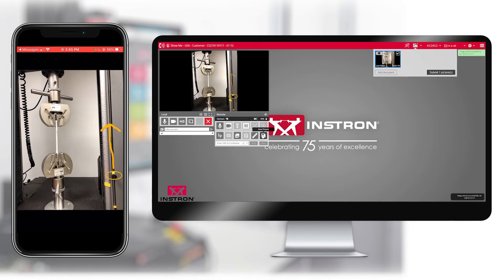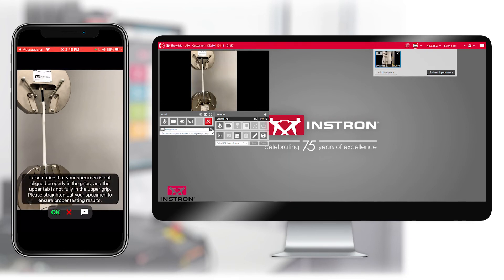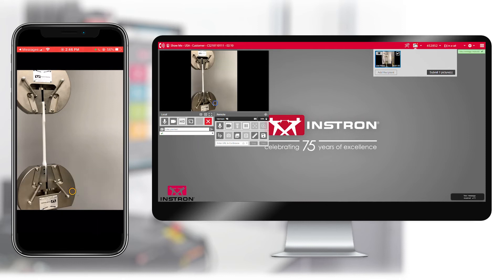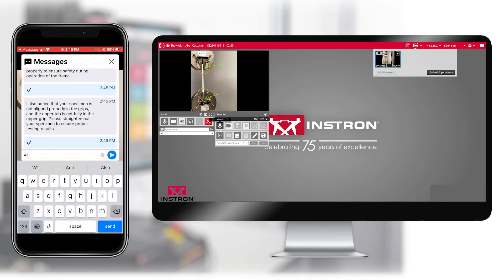The picture is then saved for later reference. Using the zoom feature, technical support zooms in on the customer's specimen and notices that the specimen is not properly aligned in the grips and that the upper tab is not far enough into the upper grip. They freeze the image and use the chat feature to communicate this information to the customer, using the drawing tools to indicate the areas where improvement is needed. The customer is able to further clarify the area of issue using the drawing feature on their mobile device and checks with technical support via chat.